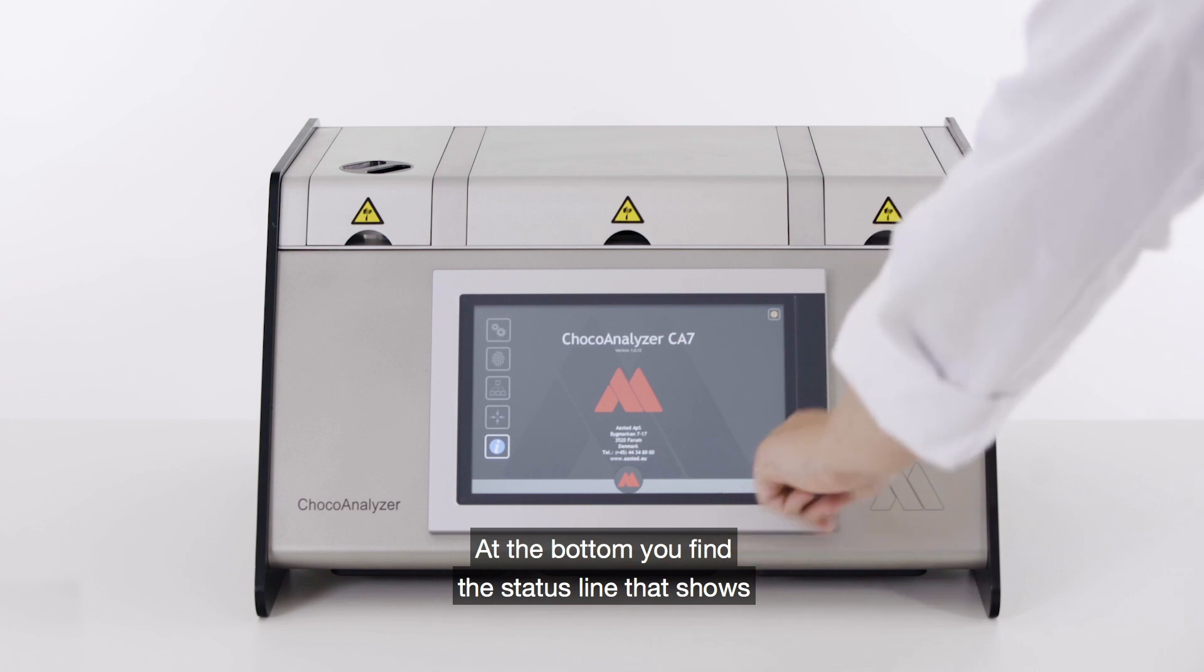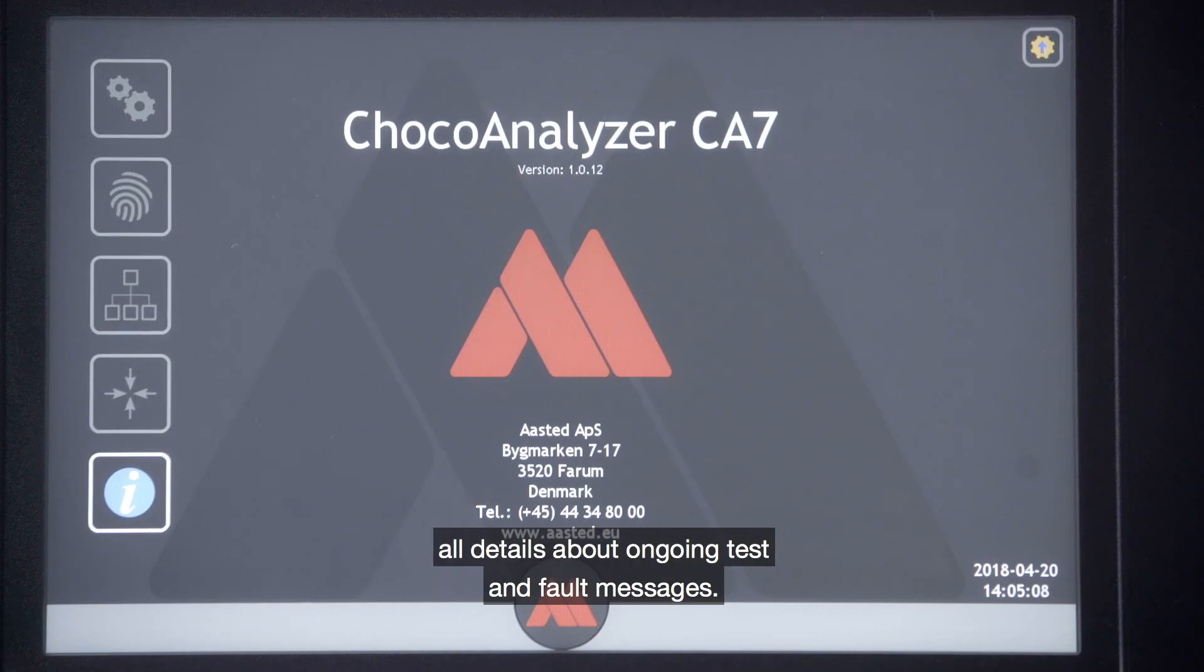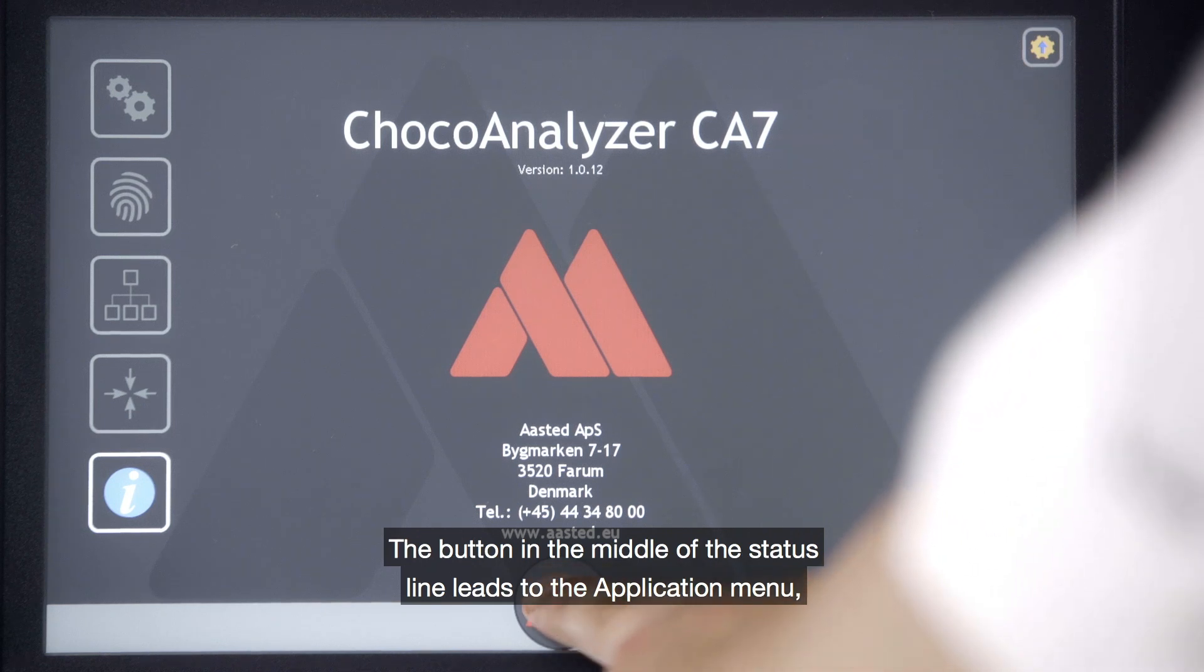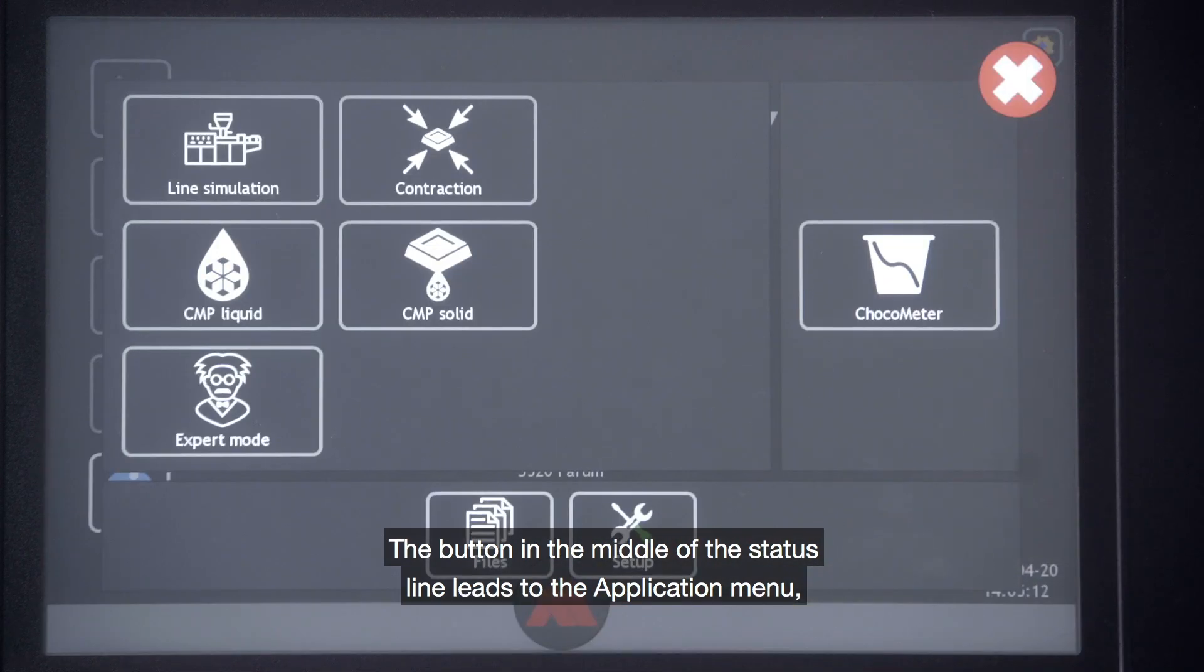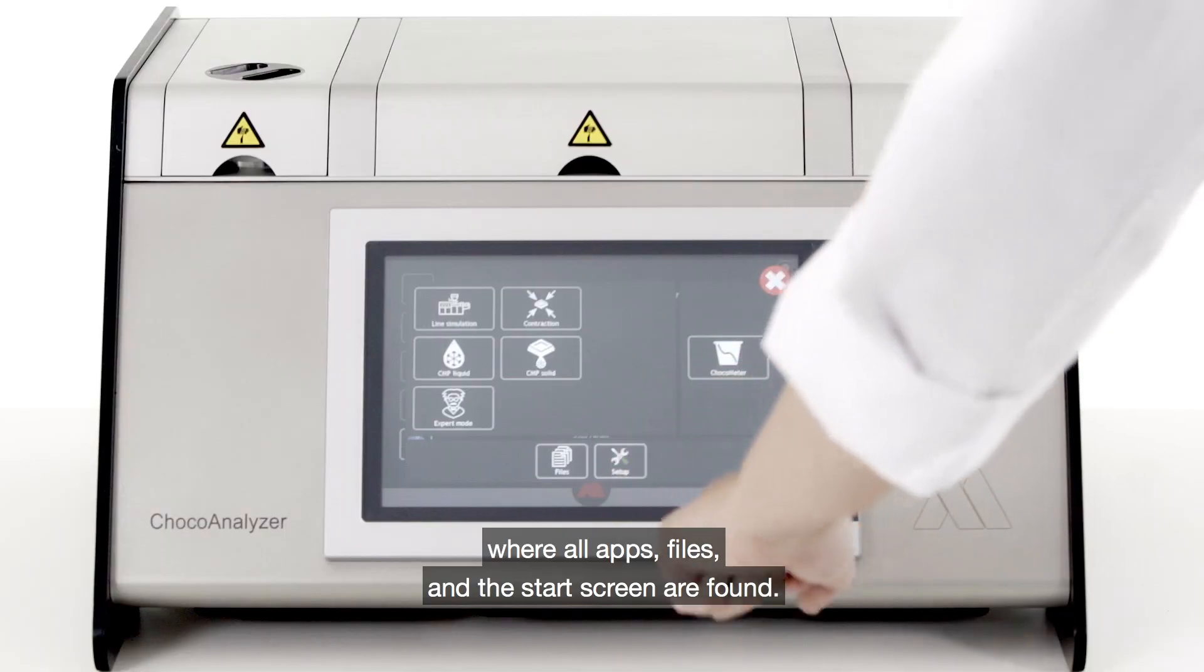At the bottom you find the status line that shows all details about ongoing test and fault messages. The button in the middle of the status line leads to the application menu where all apps, files and start screen is found.